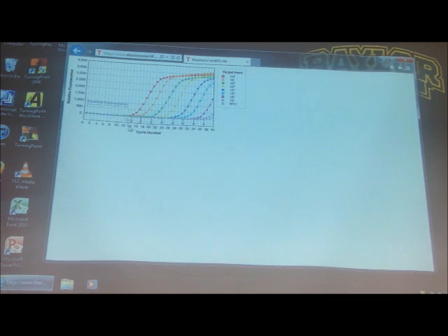But if you look at the differences here, we have liftoff at cycle 24. Here we have liftoff at cycle 27. So in other words, we don't see anything, but then by the time we get to cycle 24, we begin to see a band showing up. And here, with this amount, we begin to see a band showing up around cycle 27. So it's only 3 cycles difference.